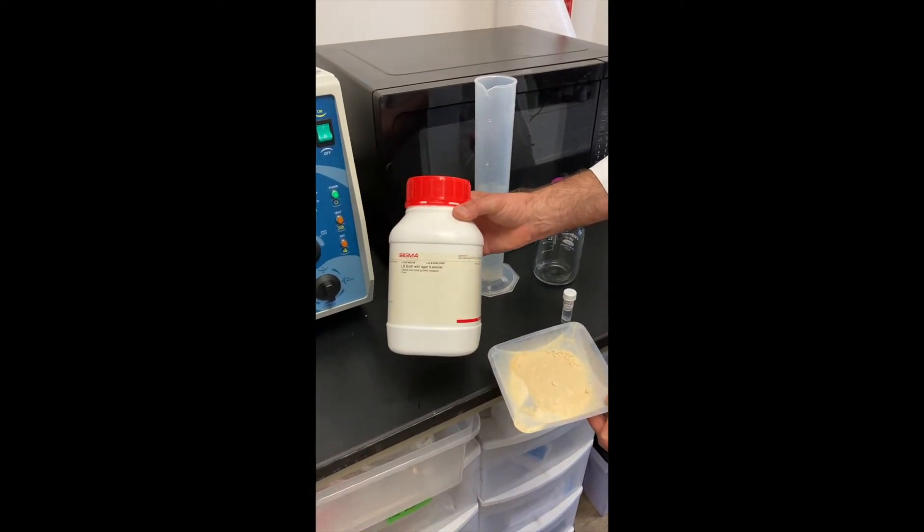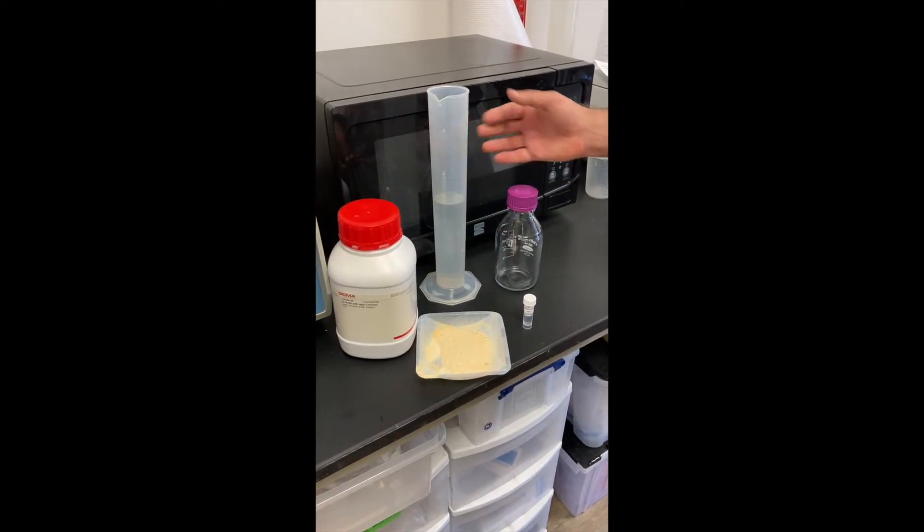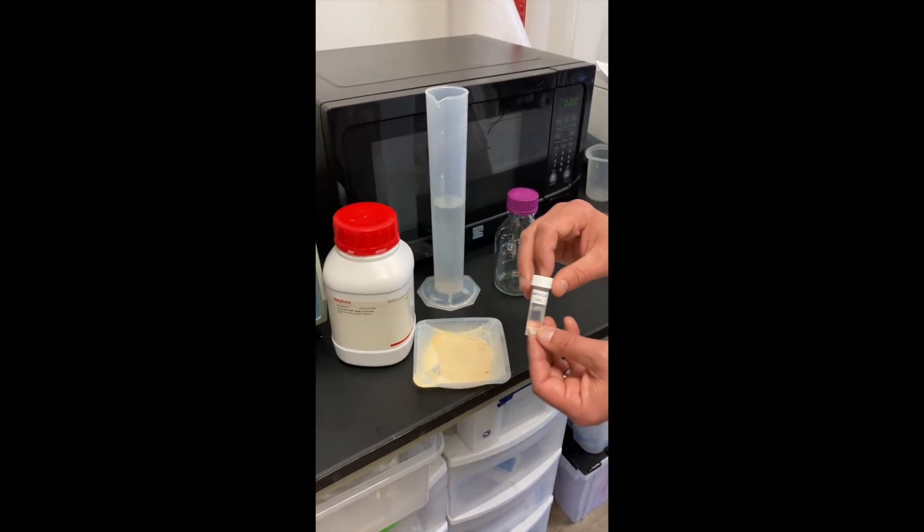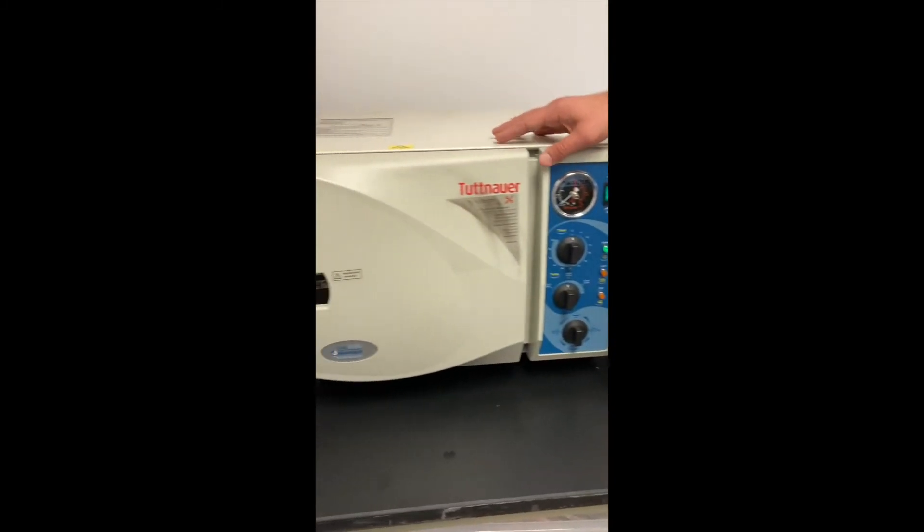To do that, as before, we'll need powdered LB agar, water, but this time we will add ampicillin, a large glass bottle, and an autoclave.